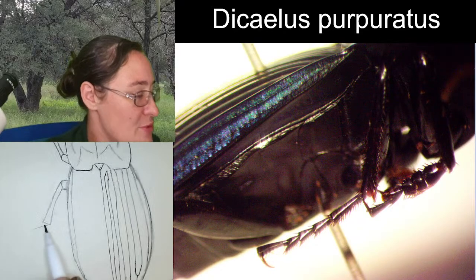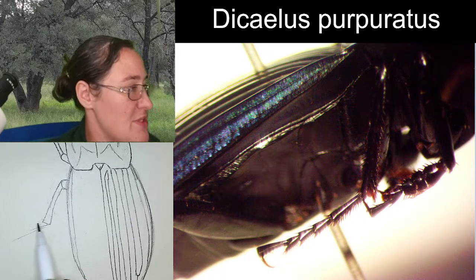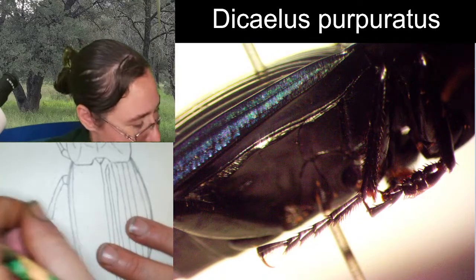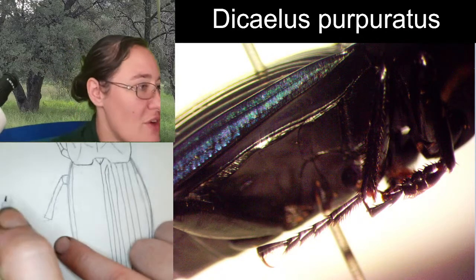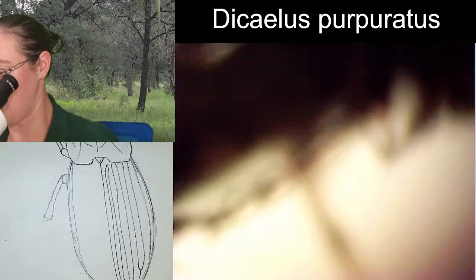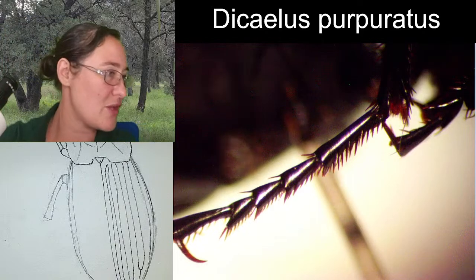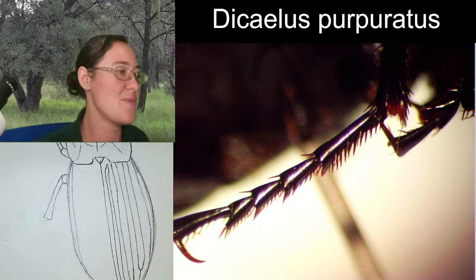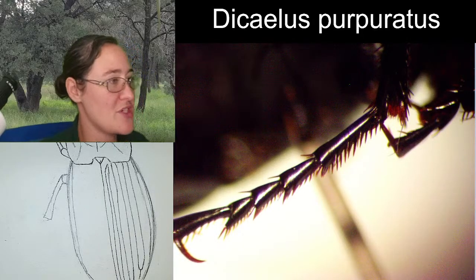And I'm going to make my tarsal segments come out in this direction. Yeah, that's going to be beautiful. So, you can actually see the tarsal segments of this middle leg pretty well. We can even zoom in a little bit if you want. All of those crazy barbs there, that helps them create friction with the ground.